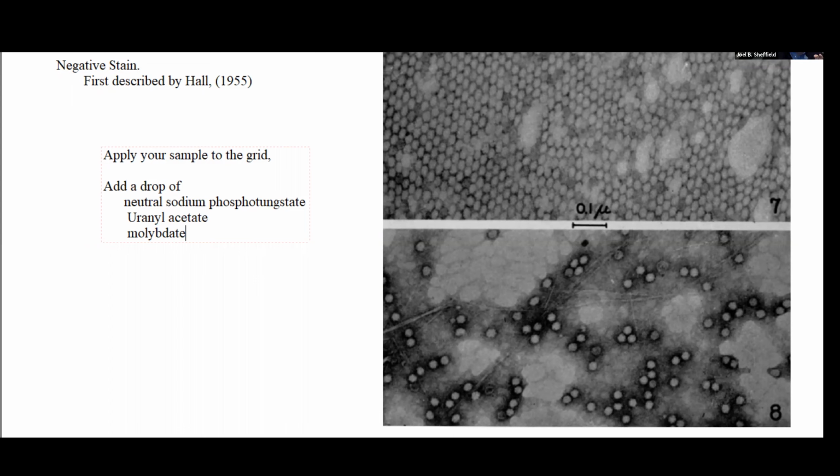And so when you have a tightly packed array of the viruses, you can see this kind of area here where the space between the viruses has got dark material. And so it enhances the general appearance of the virus. But what was more dramatic was that what he said was, well, I didn't wash it completely. Okay? When you don't wash it completely and the virus and the stain dries down around the sample, then you get this very interesting effect.